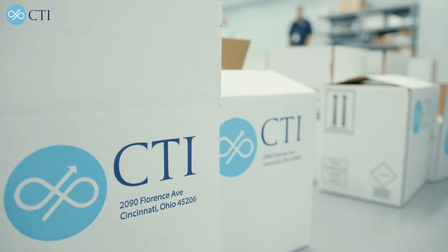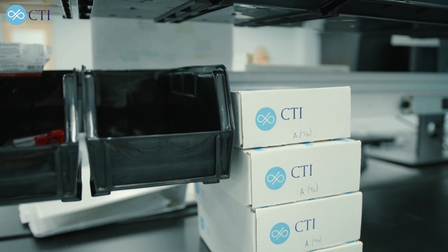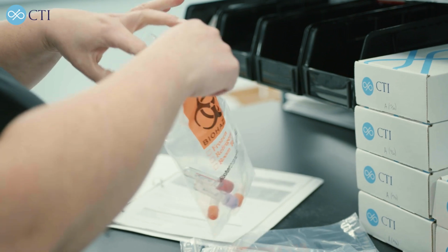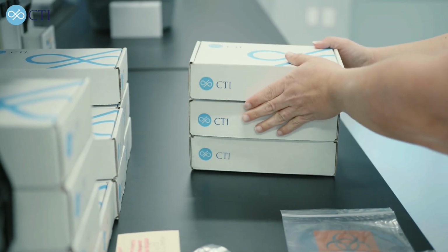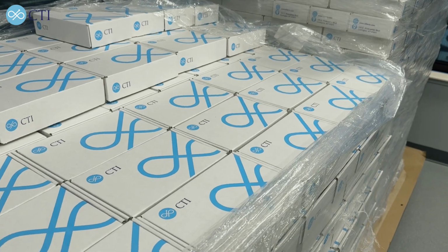Part of the central laboratory services that we provide is provision of all sample collection kits to investigator sites throughout the world. Part of the whole process is reading and interpreting the protocol the pharmaceutical company develops and deciding what the visit test schedule is, and then building the appropriate kits to collect the samples that are needed at each test or study visit. Those visits and those kit configurations can change within a study from one visit to the next, or they can be fairly consistent, but they certainly change dramatically between studies.